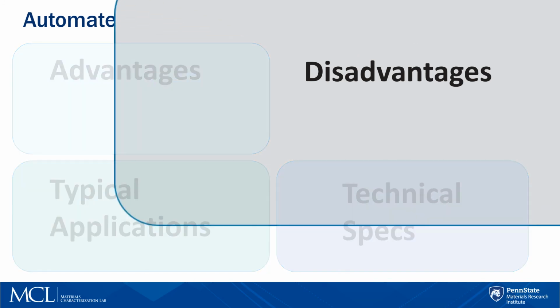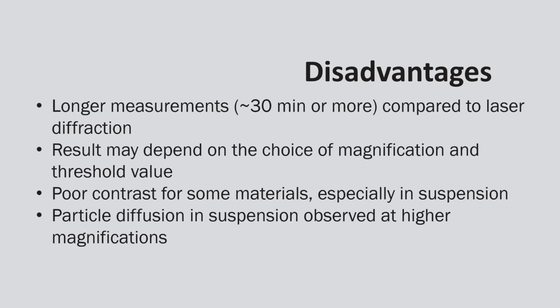Disadvantages include longer measurements compared to laser diffraction. Results may depend on the choice of magnification and threshold values. We can observe poor contrast for some materials, and also for particles suspended in liquid, we can see diffusion at higher magnifications.